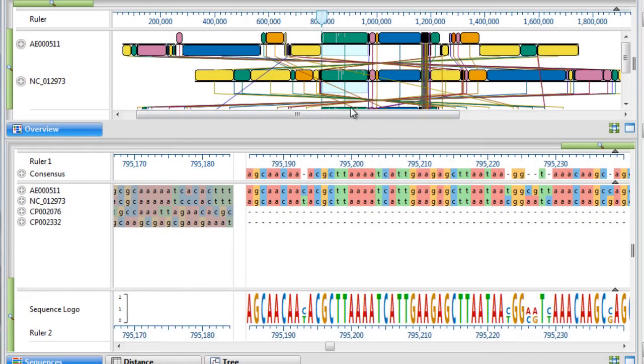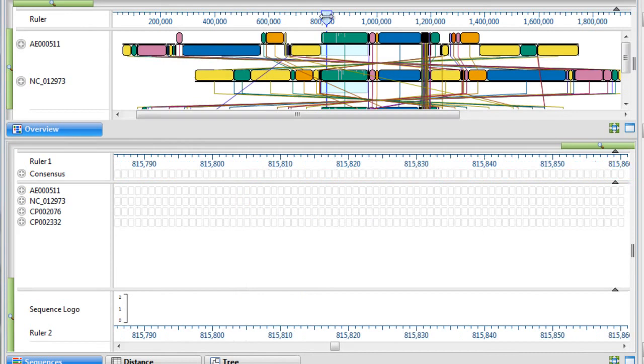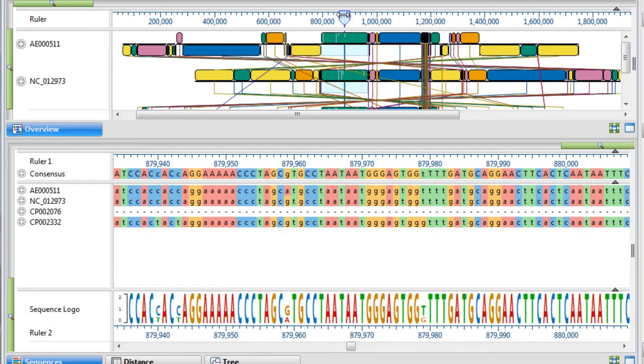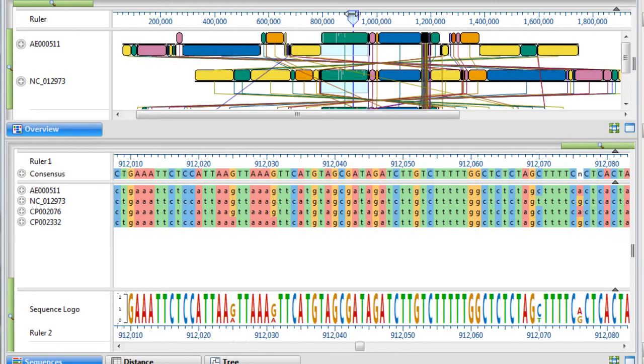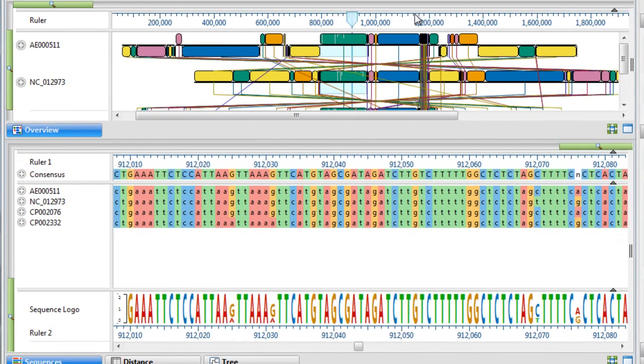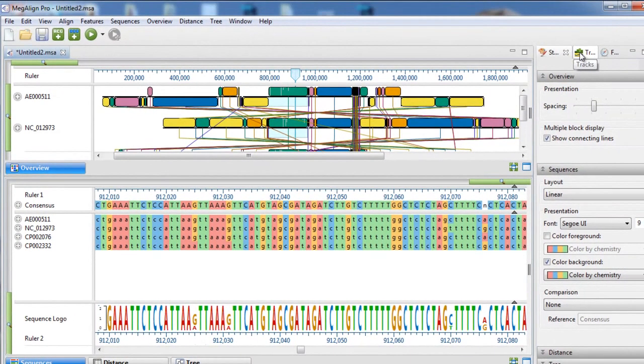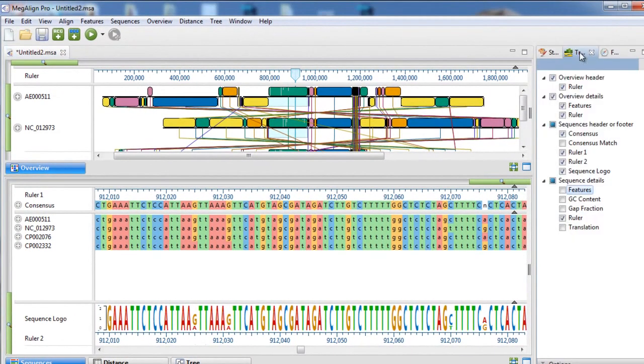We can then choose to navigate through the Sequence View using the light blue viewport. We can also choose to apply Sequence Tracks of Interest for further analysis.